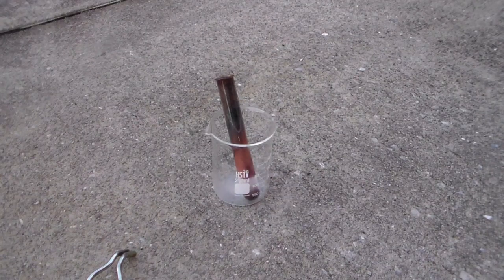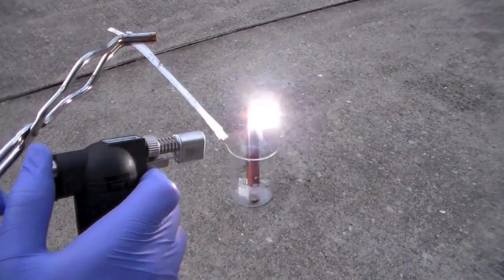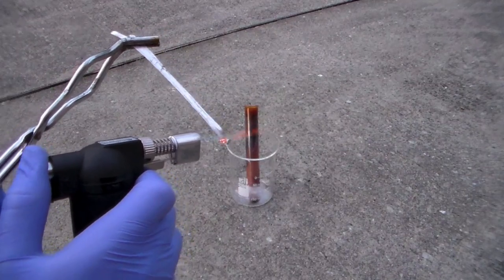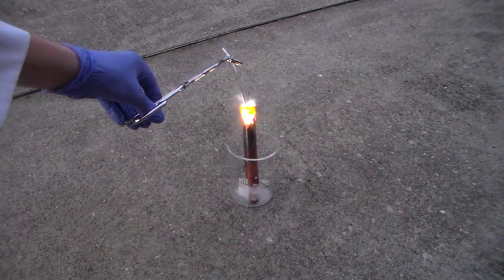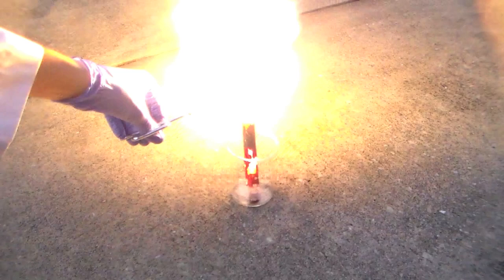After this experiment, there was surprisingly still some liquid chlorine at the bottom of the test tube, so I decided to see how magnesium metal would react with it. I heated up a magnesium ribbon with a blowtorch until it was white hot and then added it to the test tube. The reaction of chlorine with magnesium is much more violent than the reaction of chlorine with steel wool, because magnesium is much more reactive than iron.